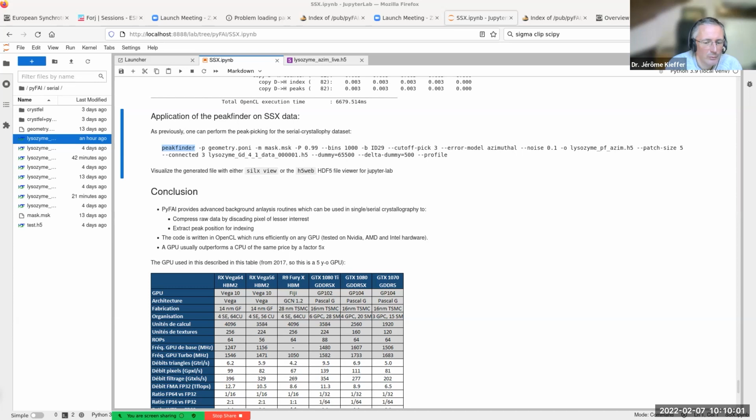So without indexing, you could compute a percentage of Bragg peaks that did not move much, but you would have to implement it yourself. And because Bragg peaks are not ordered before indexing, you have to consider the distance to the nearest peak each time. Maybe it's not that trivial.